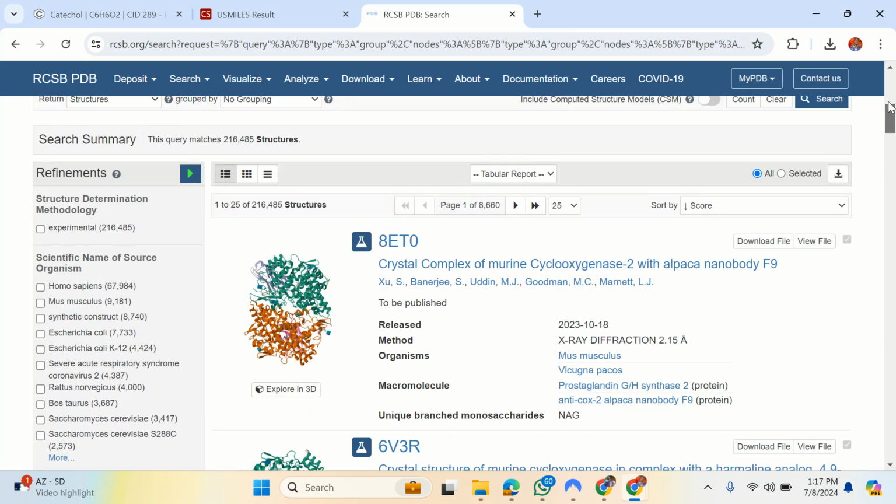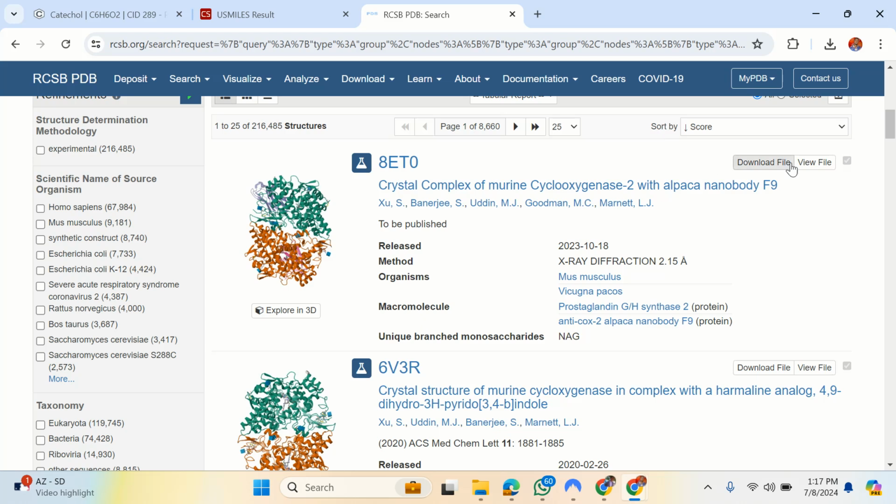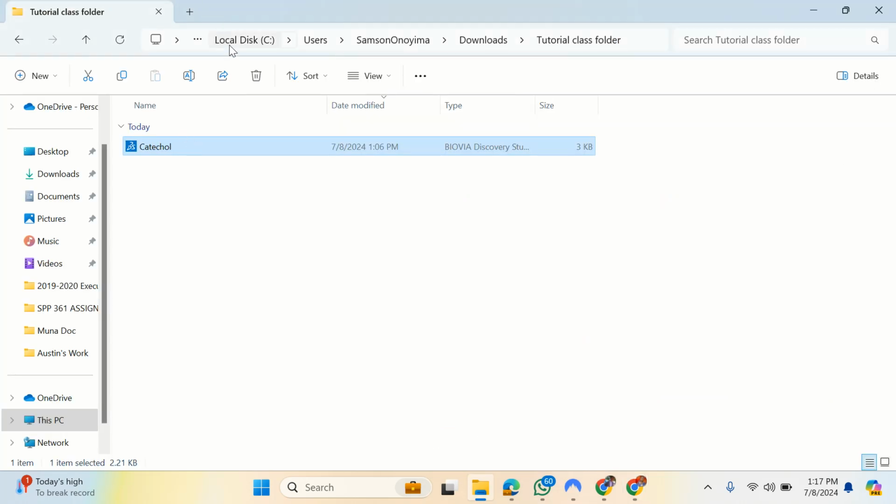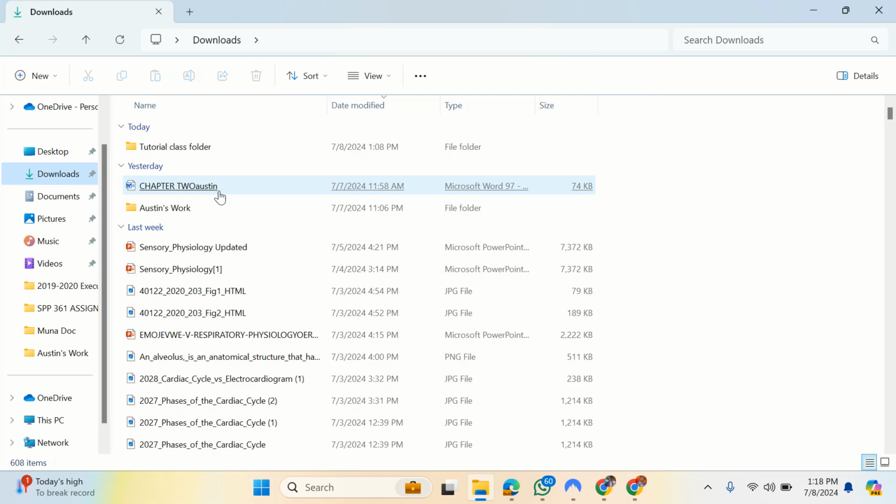But this particular one I'm going to make use of, which I can't even find here, was in complex with one of the standard drugs used for this. I've not investigated whether these were actually standard drugs, but that one was co-crystallized with a well-known standard drug against the same protein. When I say standard drug, I mean drugs that are already approved and used for drug treatment. Is that alright? Okay, so let me see if I can record that 3Q7.